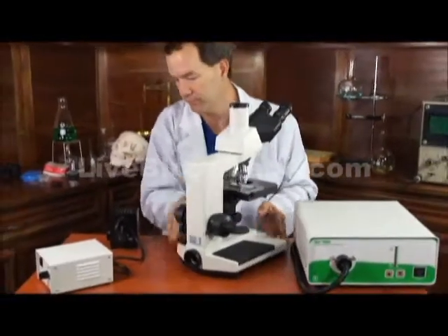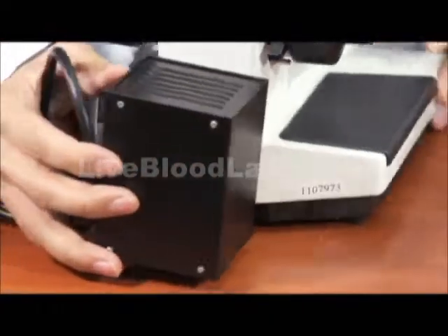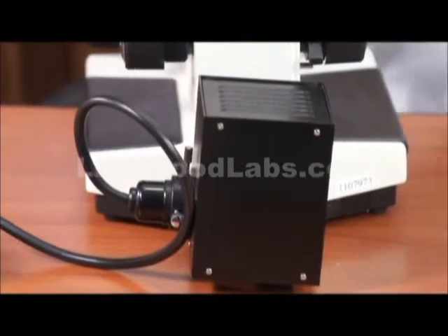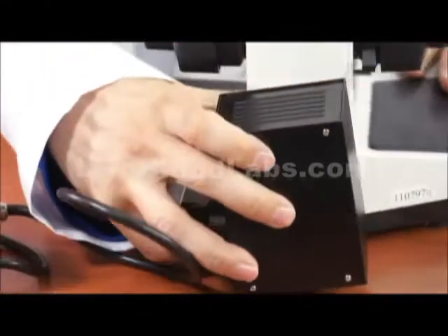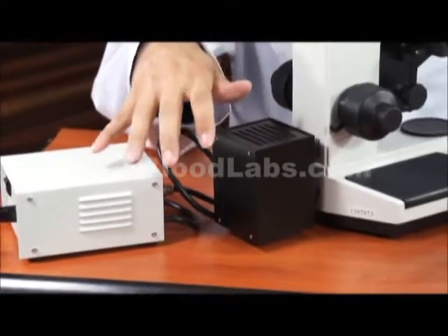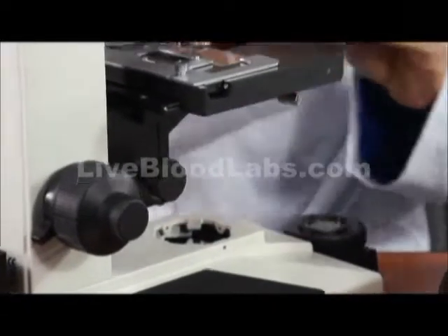Let's look at the bright field again. The light housing on the back for the bright field just fits into place, and then it has an Allen head socket on the side to tighten it into place. This is used for the phase contrast and the bright field. This is the bright field light collector at the bottom, and this is the bright field light condenser that goes to the bottom.